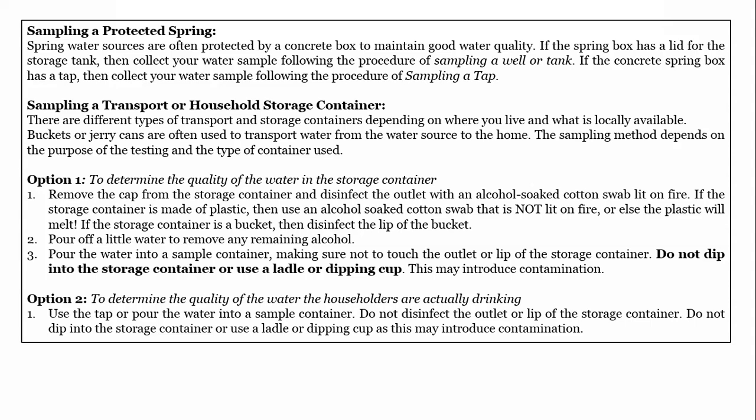So to know the actual quality of the water which the people are drinking, you don't need any sterilization. And secondly, if you need to know the water quality from the source, not the one the people are drinking, then you are going to sterilize the opening. This is just a simple trick.